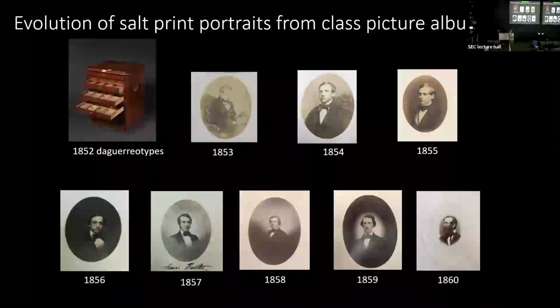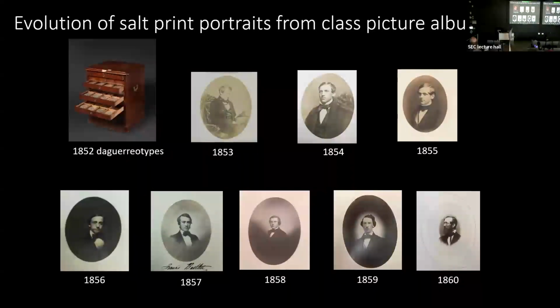But once we generated the reflection libraries, we could go through the collection of the Harvard class albums, which is an interesting collection because every year Harvard put a class album into the library. And so it's a time capsule of what the current photography technology was at that year.